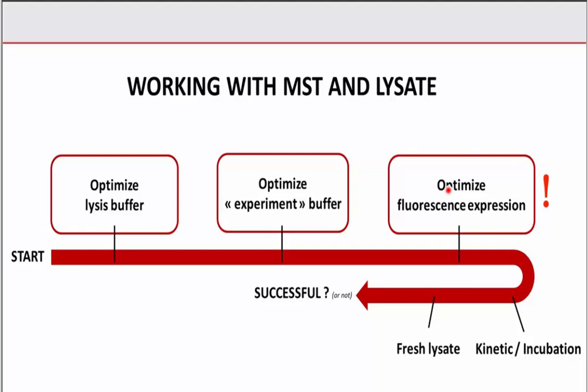You can also think of the kinetics of your system. Does it require a short incubation period? You can sometimes obtain better results with, for example, a 30-minute incubation period. So to conclude, the best results we had so far were every time obtained with what I call a fresh lysate.